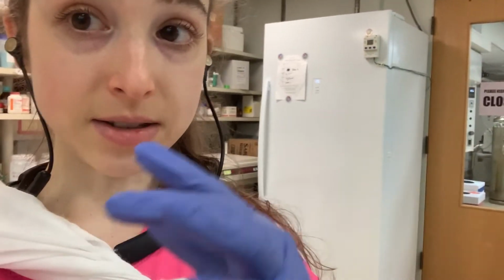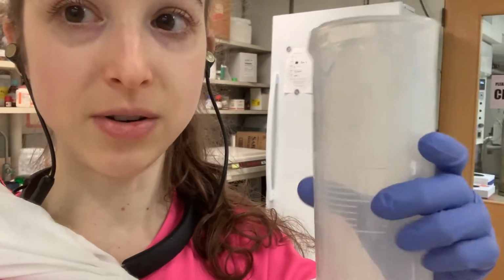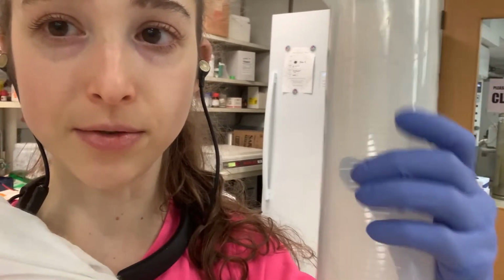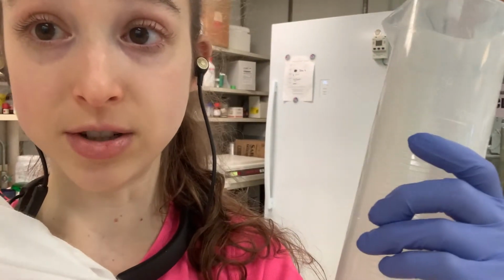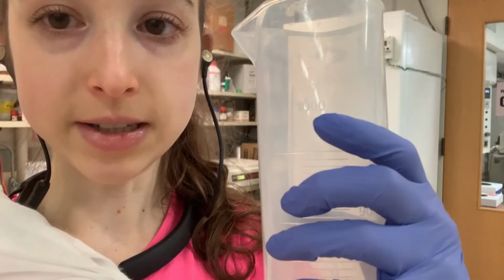Once you have it at the right pH that you want, you're going to need to adjust it to the final volume that you want. And so here's why it's important that you leave enough room, because if you ended up having to super adjust the pH, then your volume is going to increase.